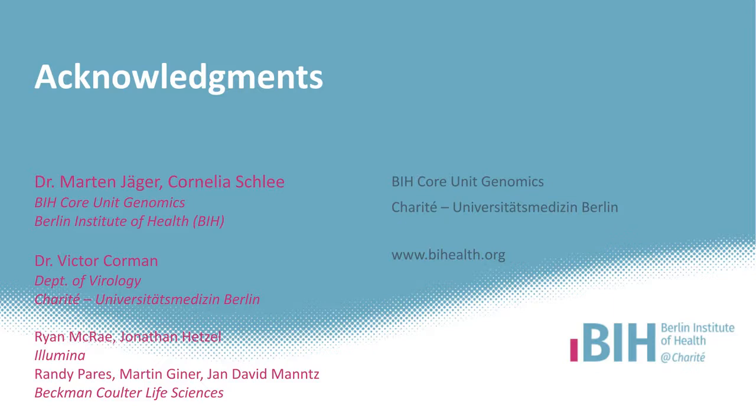I think Tomasz, you might have a couple of other suggestions. So first of all, the size of the user base, especially with regards to users from the academic community, and then of course the number of already implemented NGS protocols. And what is really important in terms of on-site assay development, in terms of automation, is of course the availability of local service support.